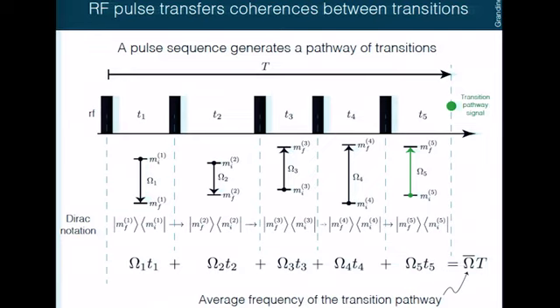Now, when you do an NMR experiment, you're applying a lot of pulses, and when you do that, you're exciting transitions. When you apply the first pulse, you excite a transition. The next pulse will move the coherence associated with that transition to another transition, and the next pulse will move that one to another transition. So we do this hopping from transition to transition, and eventually we get to a transition where we turn the receiver on and we detect the signal. The phase of the signal that we detect depends upon the history of all the transitions that you lived in on the way to that observation.